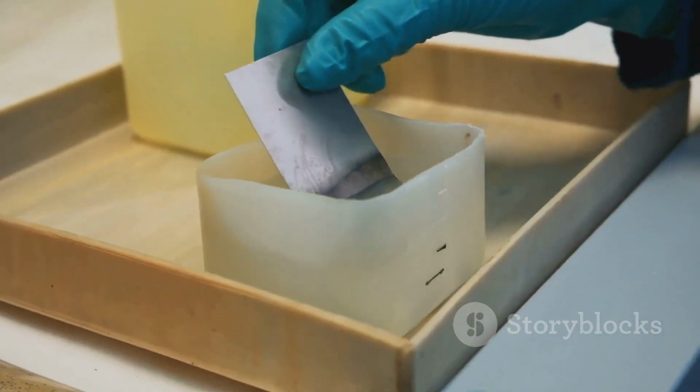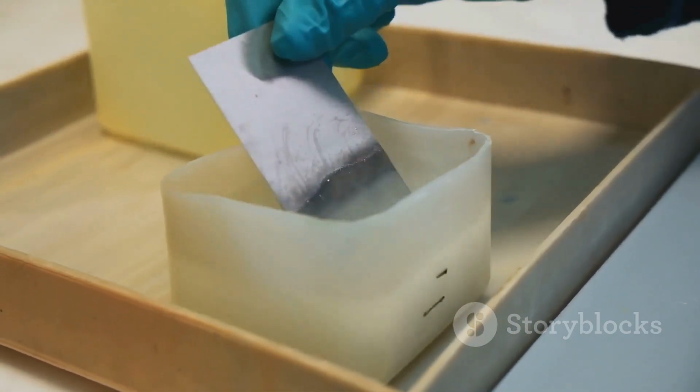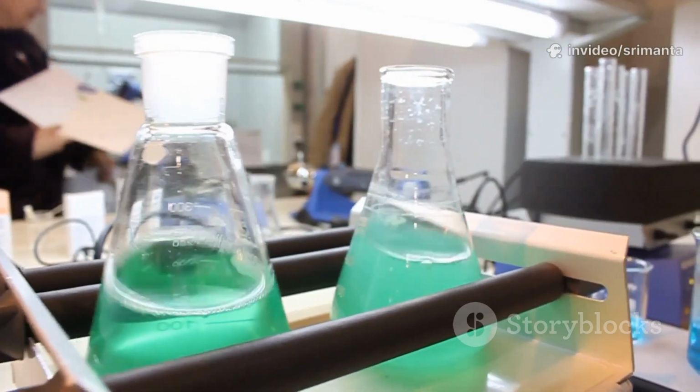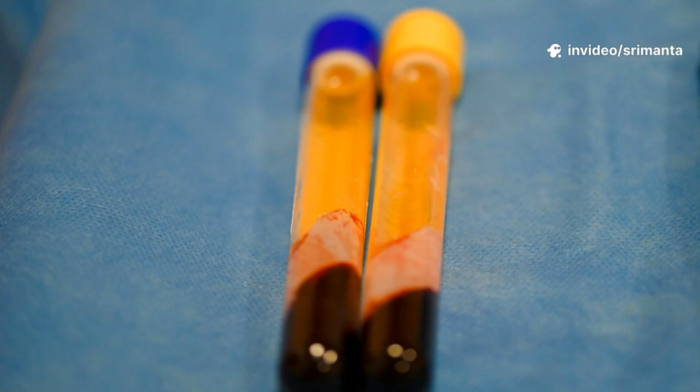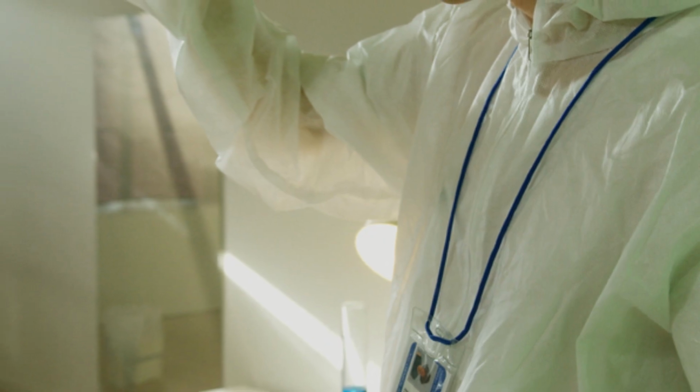After the time is up, we carefully remove the mercuric chloride papers from both the test and the standard setups. Now comes the moment of truth, the comparison. We place the 2 papers side by side and observe the stains. The standard paper will have a distinct yellow stain. We then look at the stain on the test paper.